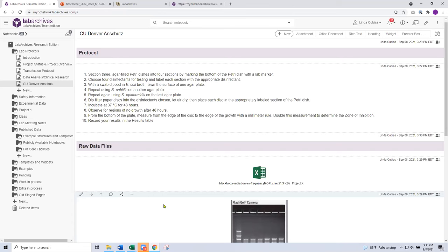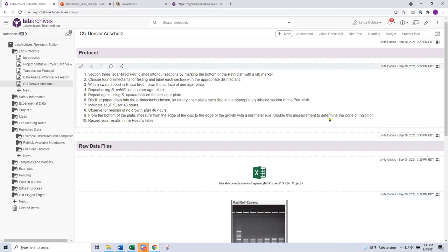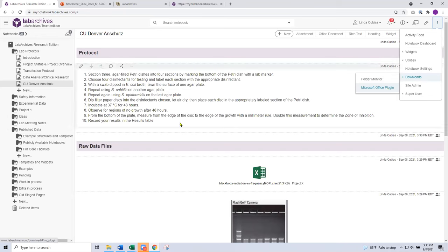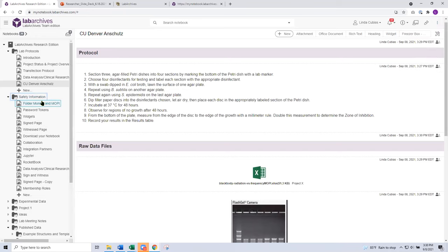A couple of other entry types to introduce as well include our folder monitor and Microsoft Office plugin. If there's interest to use these two tools, they are required to be downloaded separately to your PC or Mac. Those two downloadable features are part of our skewer icon under downloads: folder monitor and Microsoft Office plugin. I'll introduce you to them first and you can decide if that's a tool you may use and therefore want to download.